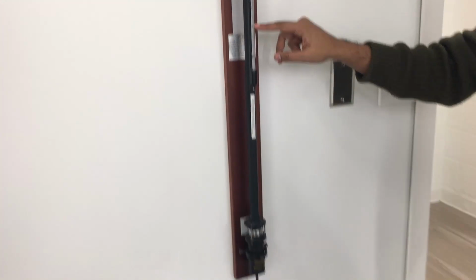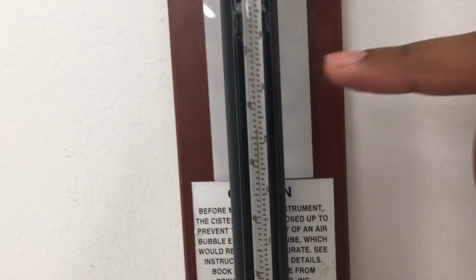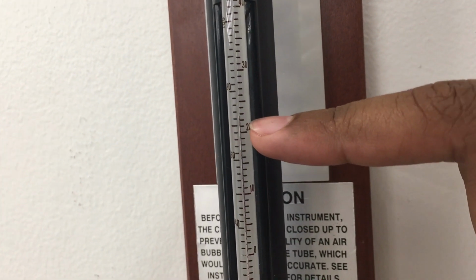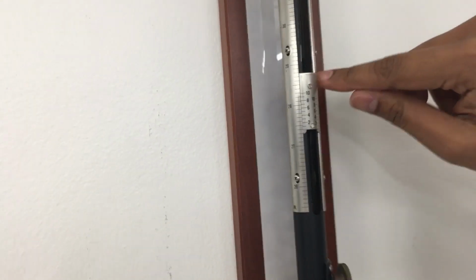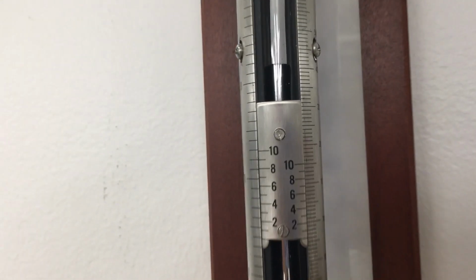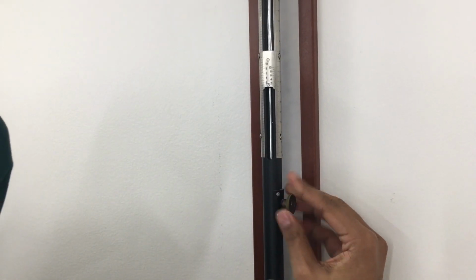So barometric pressure is a very similar thing to reading a thermometer, which is right here. So the temperature of the room, as you can see, is about 22.5 degrees Celsius. Now, the barometer is right behind the thermometer. So this level of mercury shows us the pressure of the room. So you see that level mercury line right there. So looking at the measurement, it looks like it's about 740 something millimeters of mercury.